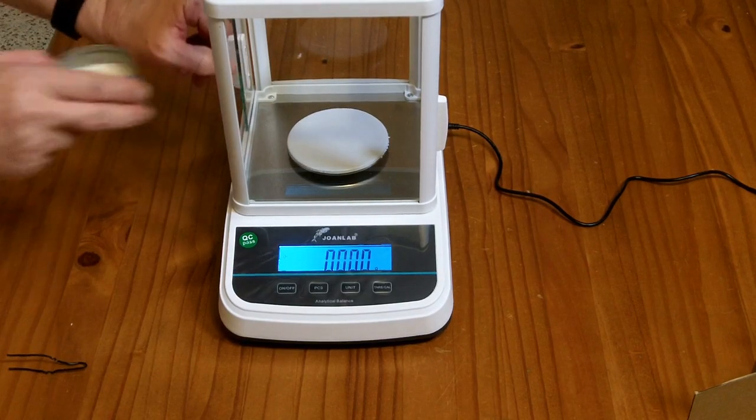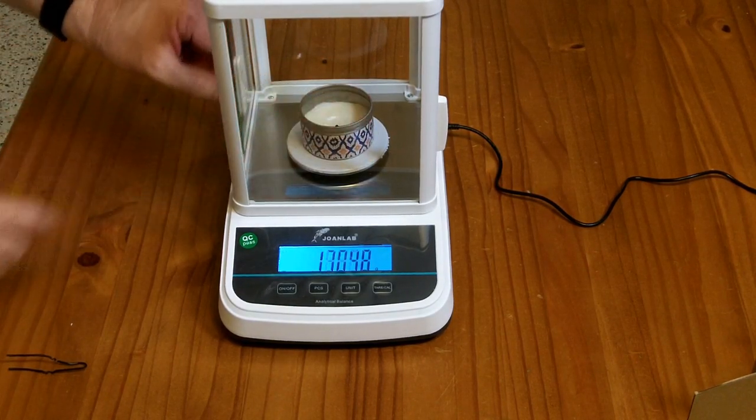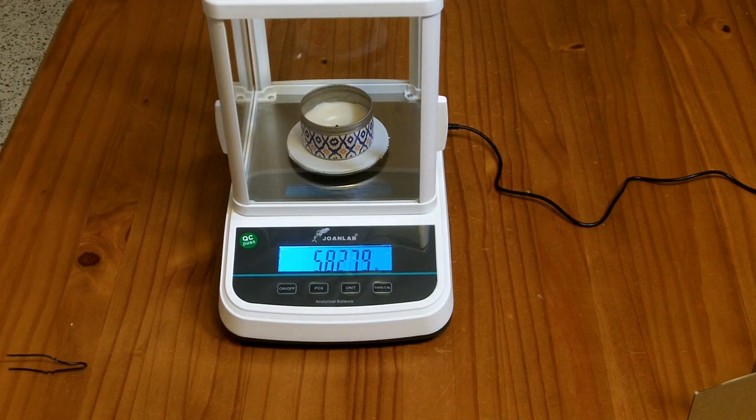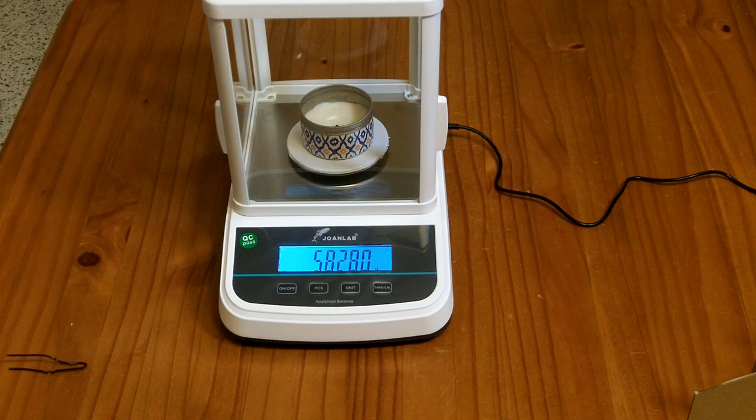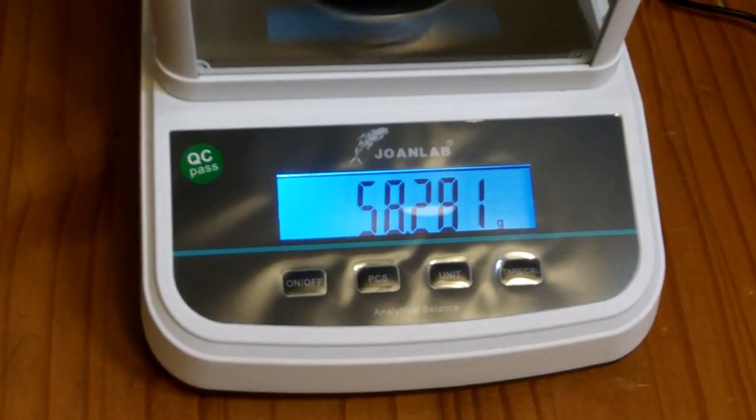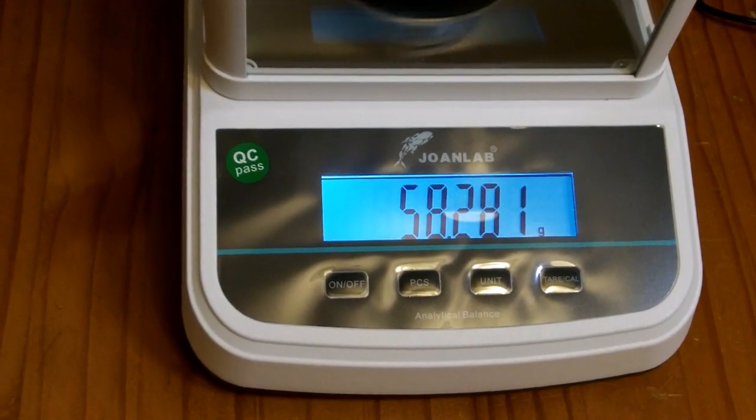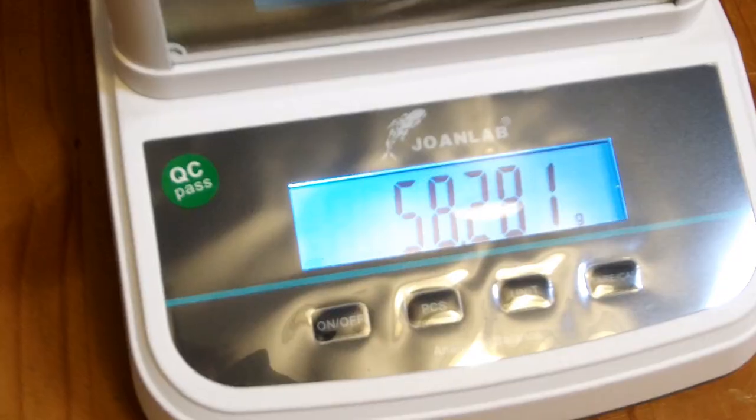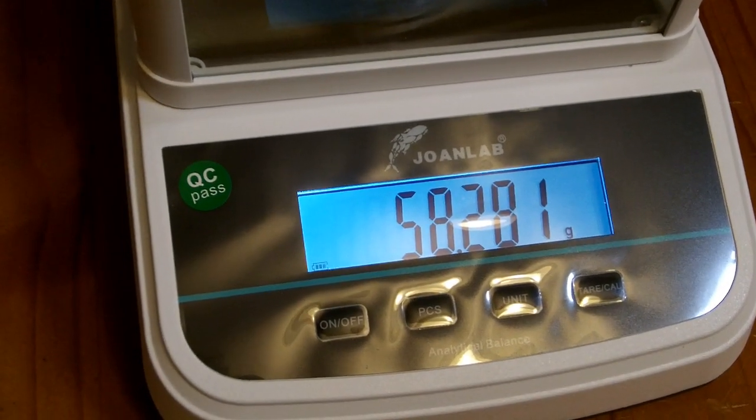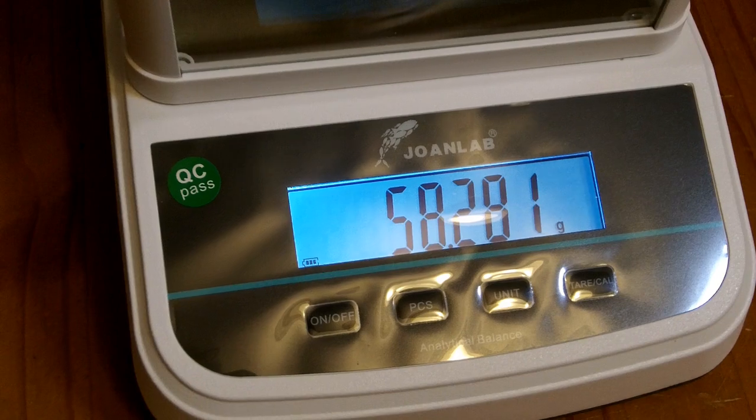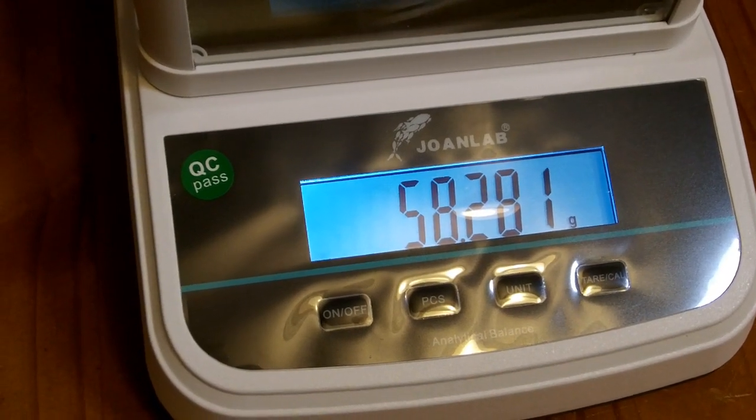Alright, so now we put the candle after it's been burnt for 20 seconds on. And it is 58.280 grams now. Or maybe 58.281, depending on how I walk around the table. Alright, so 20 seconds of burning this candle is somewhere between 28 and 29 thousandths of a gram worth of wax that has been burnt.